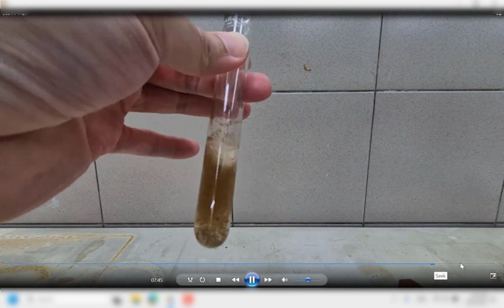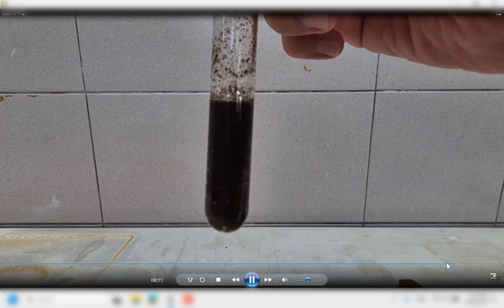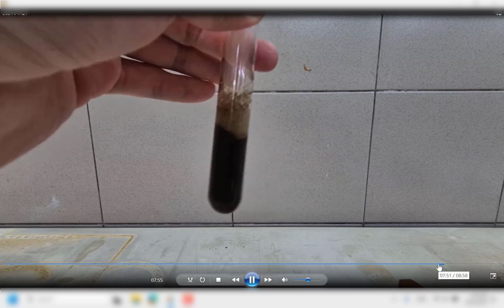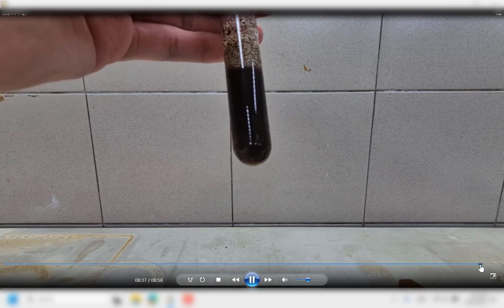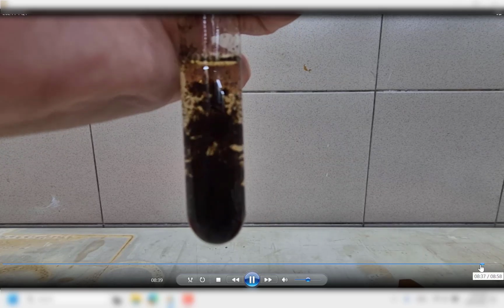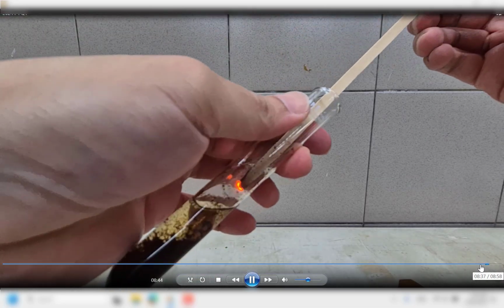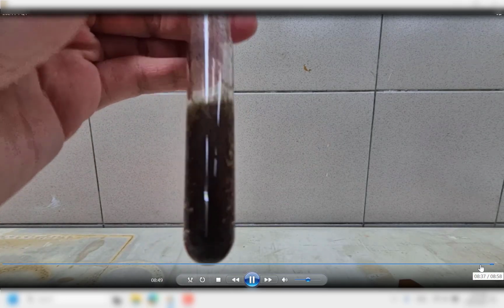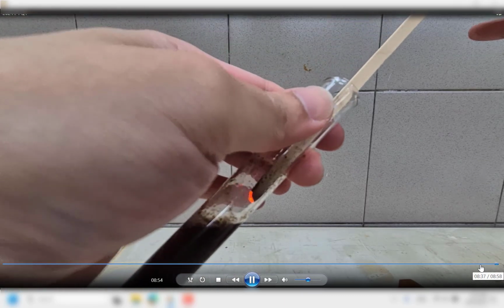Now at the end of the day, what is the color of the solution? So I just rewind a little bit more. Rewind a bit more. Yeah, you notice that it gives you a very dark brown solution. The PPT remains, and of course if you leave it long enough, the effervescence ceased. There's no more effervescence. The remaining amount of oxygen will of course light up the lighted splint a little bit, but not really.